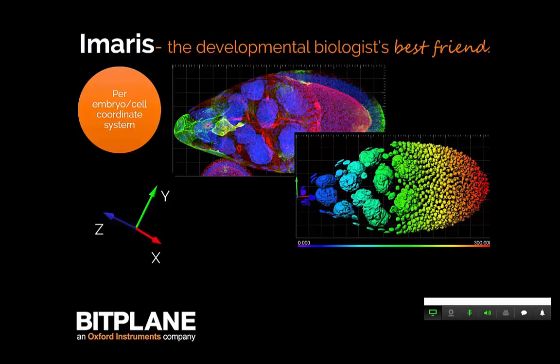So in this particular example, and hopefully you can see, we can place a reference frame at a particular point within that embryo, and then all of the other compartments that we have modeled using, in this case, a surface model, have been color-coded based on their distance from this particular point. So we have a calibration down here showing you that 0 is basically a 0 distance, and 300 in red is indicating the furthest distance for that embryo.